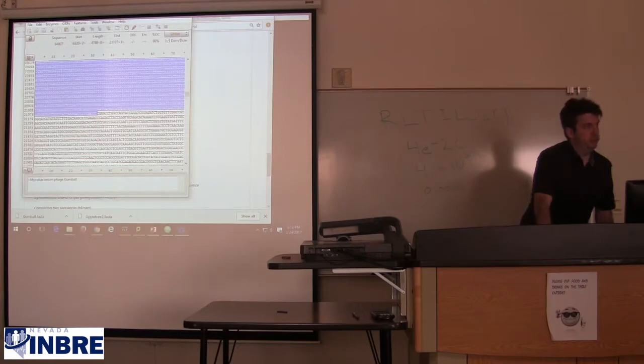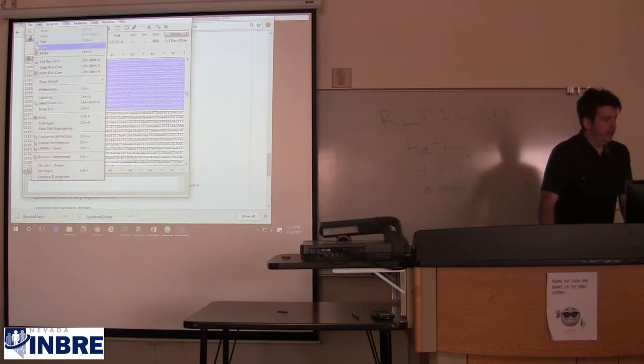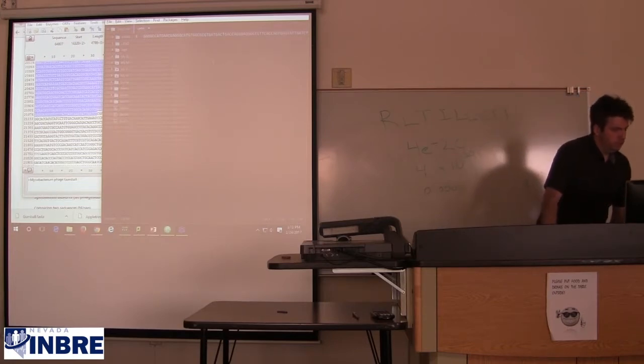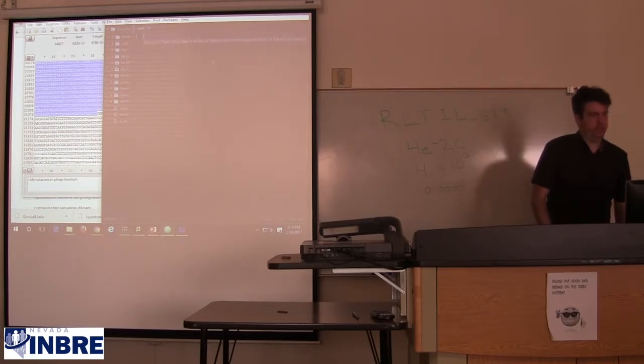And so we want to copy this sequence, and we're going to paste it into Atom so we can give it a name. So we're going to go Edit, Copy, and hit Control-N in Atom for a new file. Paste that naked sequence of 4,788 bases or so. And it's just going to fit on one line. And so we hit up to get to the front of that line after we paste it. And we're going to hit return so we get a blank line on top.